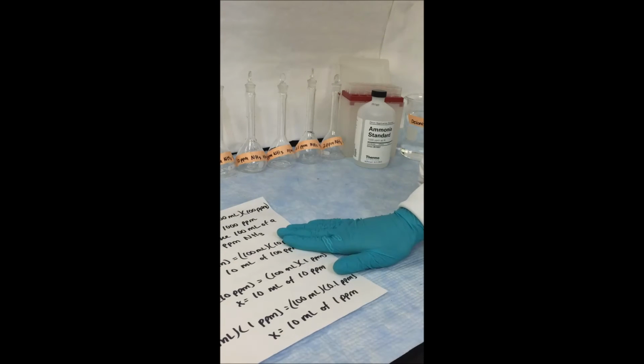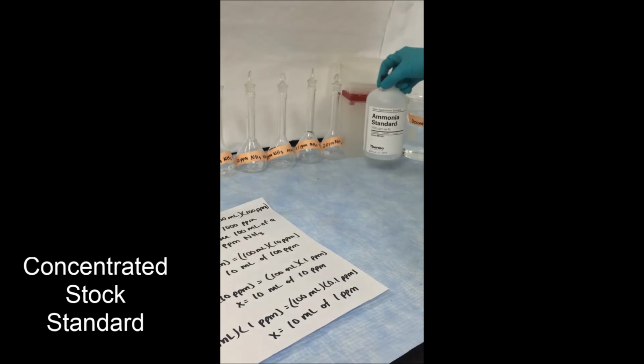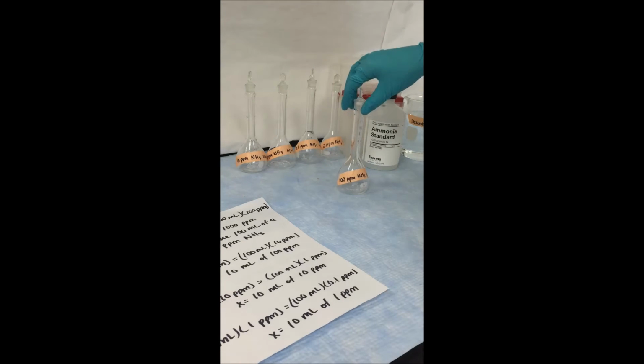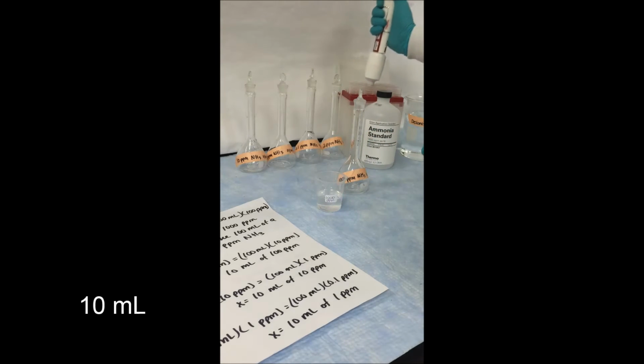Starting in lab with fresh, clean glassware and our concentrated stock solution, we're going to use a 100 milliliter volumetric flask to perform the 100 part per million dilution. Using a clean beaker, we are going to pour out a small aliquot of our concentrated stock solution at 1,000 parts per million to draw from.